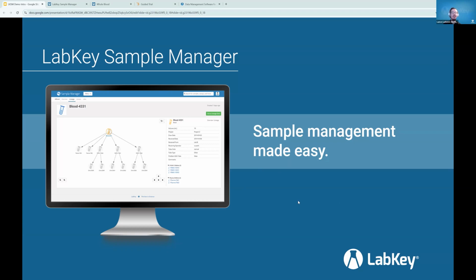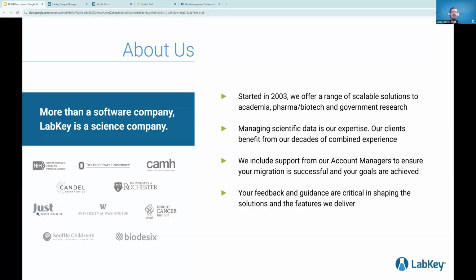So a little bit more about myself. I used to be in an infectious disease and microbiology laboratory for organ and tissue donation. So we were processing thousands of samples every day, running them through different assays, making sure that we had all the results that we needed, and tracking where all of our samples were in storage was very important. So I'm very familiar with a bunch of different LIMS, Excel spreadsheets, paper records, a lot of what our labs are coming from that have been using in the past. But I'm really excited about how Sample Manager and LIMS takes a lot of the good aspects of those softwares and improves on them, and then takes a lot of the bad aspects of those and actually improves those characteristics in one easy to use software.